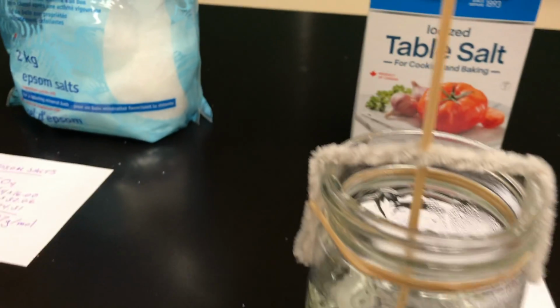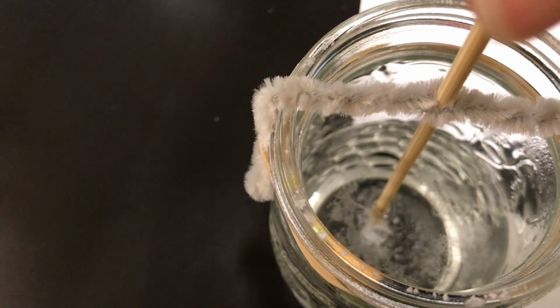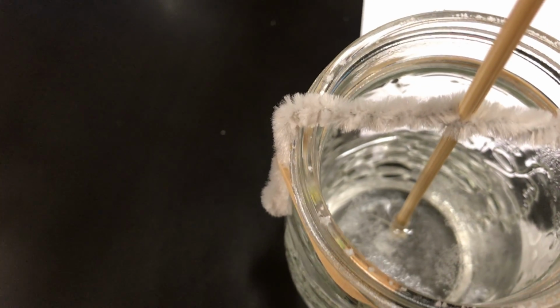I also had on the surface some, I don't know if the camera can pick it up, but on the surface, there's a little bit of a film, and those are crystals starting already on the salt.